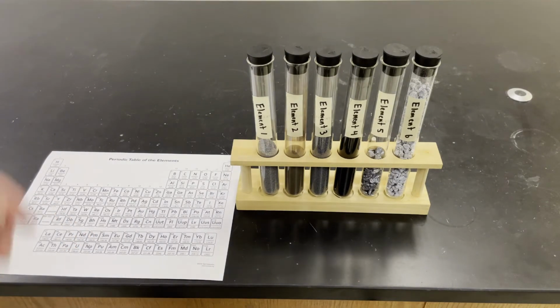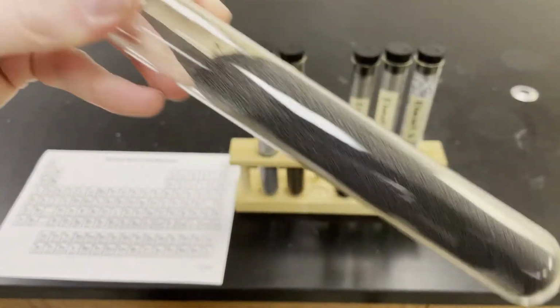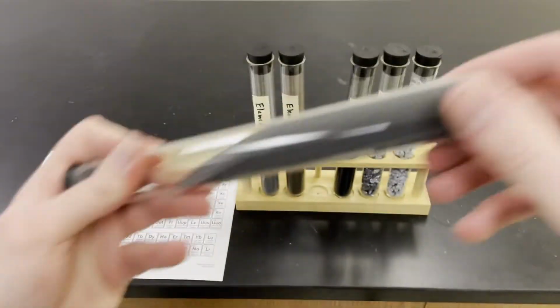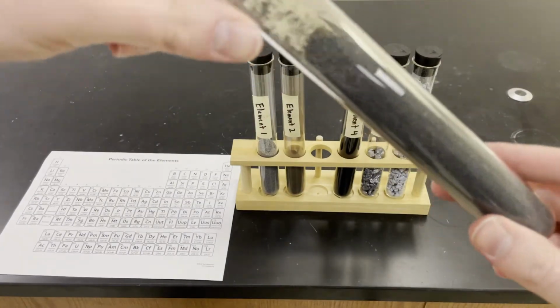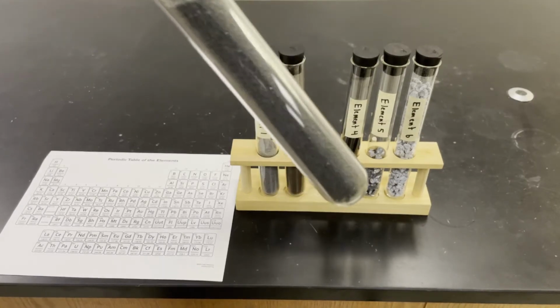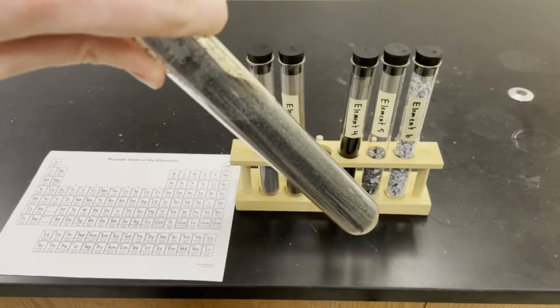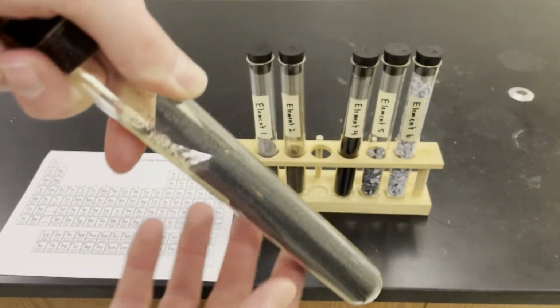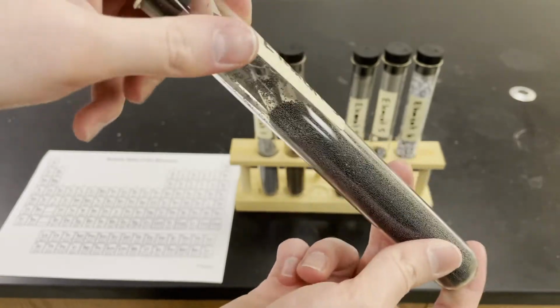Let's do 1 more of these. Ooh, this is a heavy one. Okay, so this guy, oh man. Shake that around, you can hear that. This guy has a mass of 207.2 grams in 1 mole of this element. So this has a molar mass of 207.2 grams per mole.